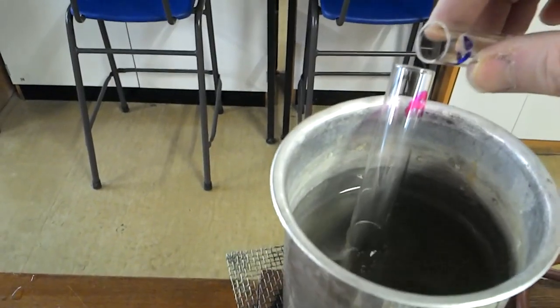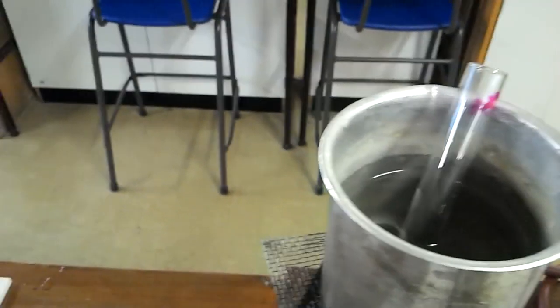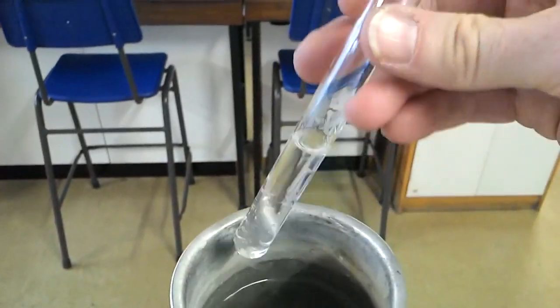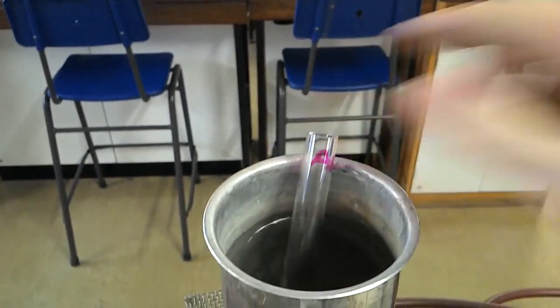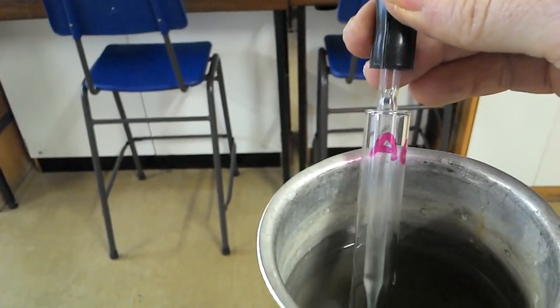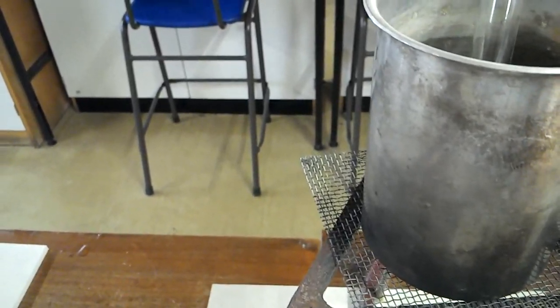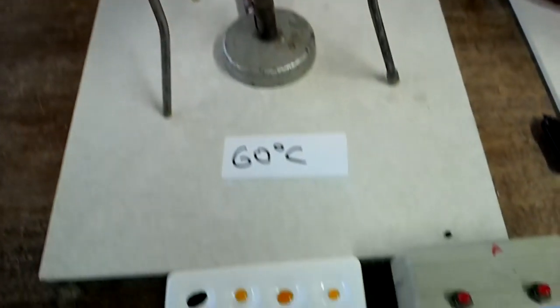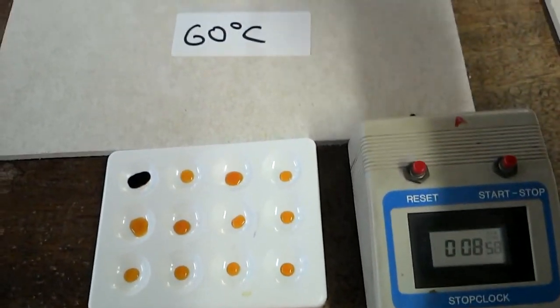So now 60 degrees. Again, mix your starch and your amylase, your enzyme, your substrate. Flick mix. Make sure you mix it well. Back in the solution. Start the clock. First sample coming out for time 0, which is actually getting in there roughly about 10 seconds. In he goes. And then in half a minute we're going to take our next sample.